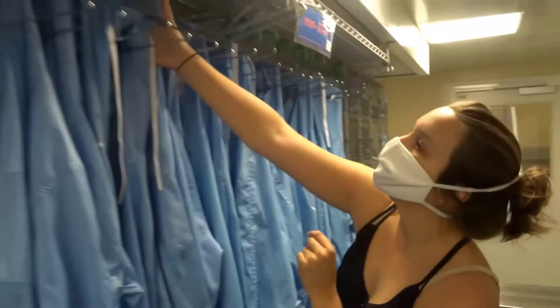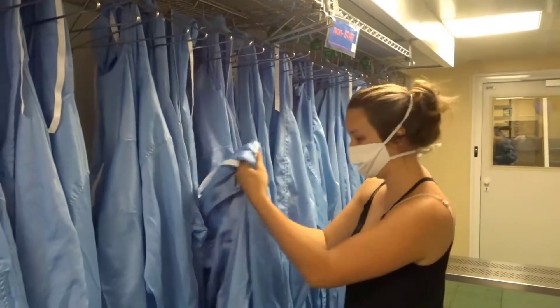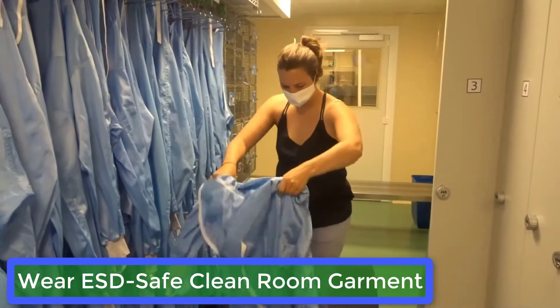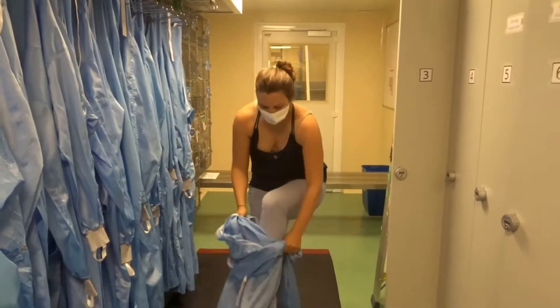All the garments on the hanging rail are clean, so you are free to choose the one that fits your size, and start dressing by first putting your legs in, taking care not to touch the floor.